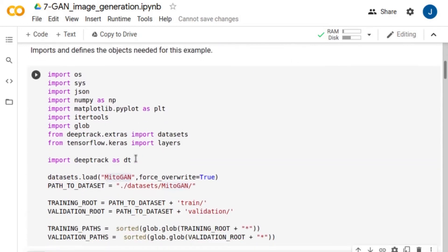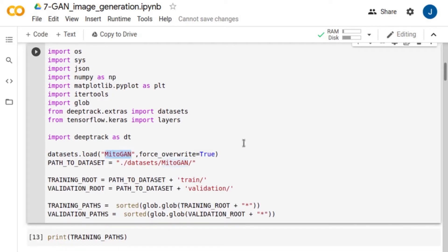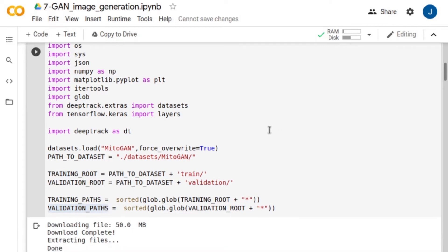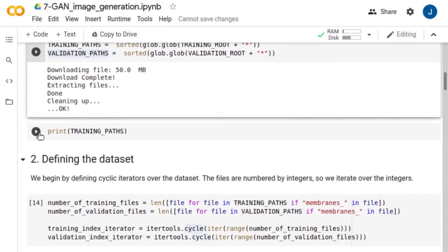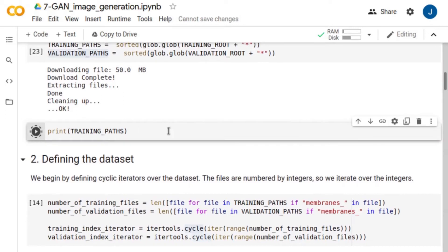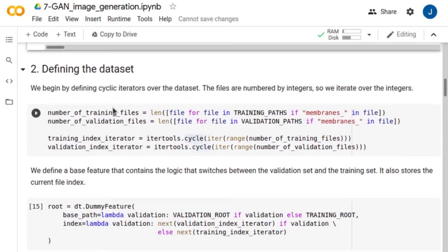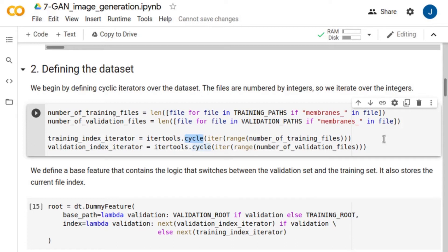First we need to import the required packages, download the database, and define the paths to training and validation data. If we have a look at the database we will see that the files are numbered by integers. Hence we need to compute the number of images we have for both training and validation and iterate over those integers by defining a cyclic iterator that we will use for reading the images.